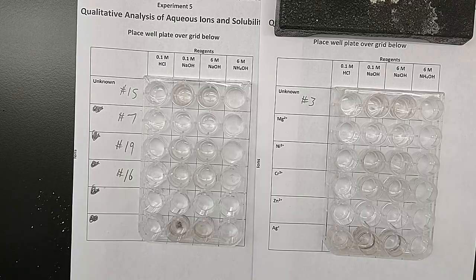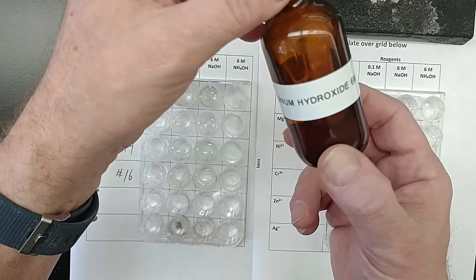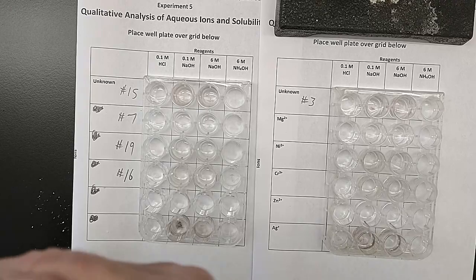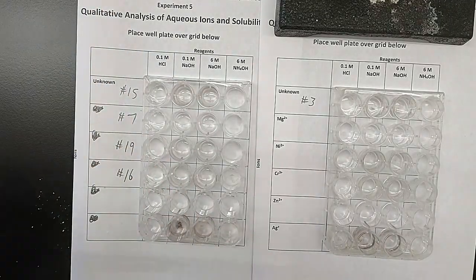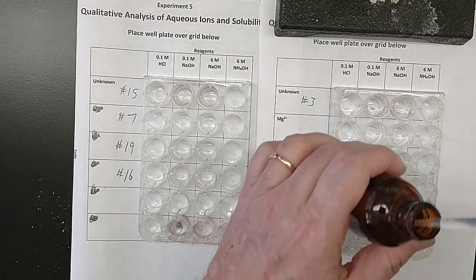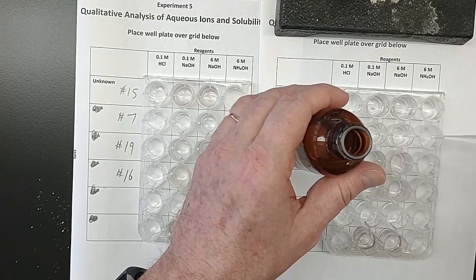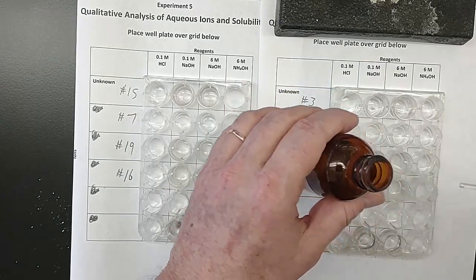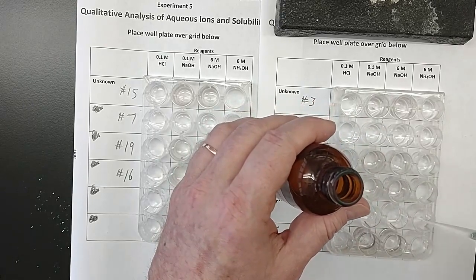Ammonium hydroxide. 6 molar ammonium hydroxide. Stopper doesn't work, so I'll get a different one. Ammonium hydroxide is commonly known as Windex, if it was colored blue. Also known as smelling salts in a first aid kit.